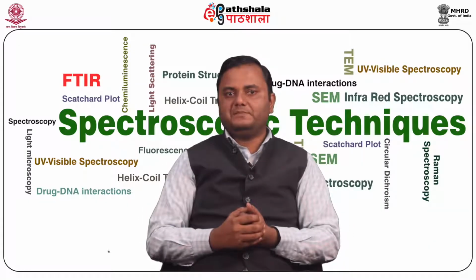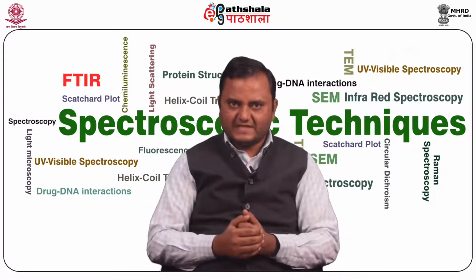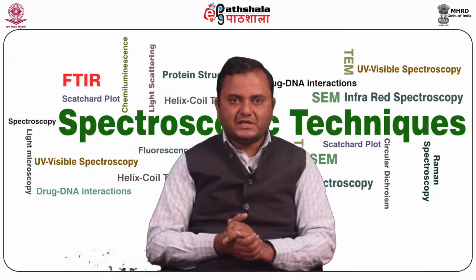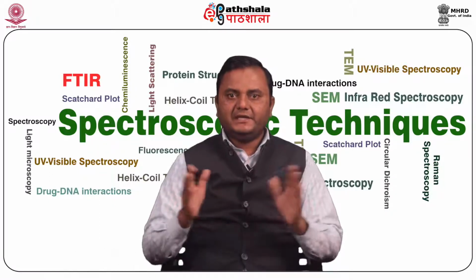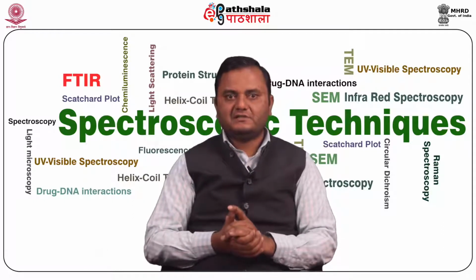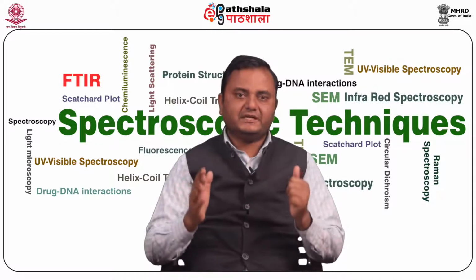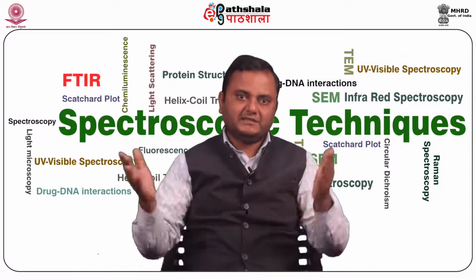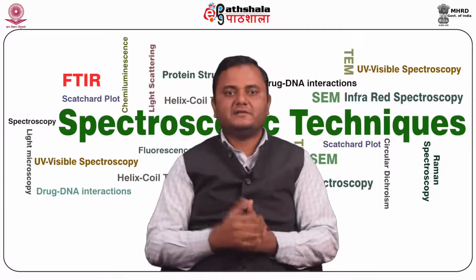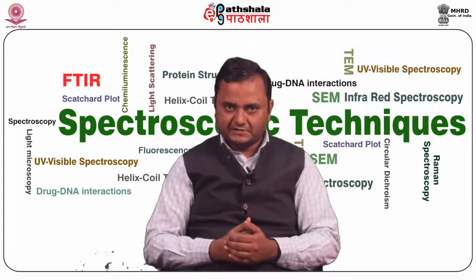Let's start with the basic principle of Fourier transform IR spectroscopy, termed FTIR spectroscopy. FTIR spectroscopy is a vibrational spectroscopic technique, meaning it takes advantage of asymmetric molecular stretching, vibration, and rotation of chemical bonds as they are exposed to designated wavelengths of light, mainly in the IR region. The Fourier transform transforms the signal from the time domain to a representation in the frequency domain. That's the main advanced feature.